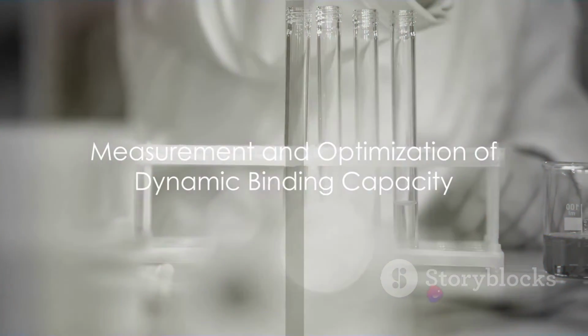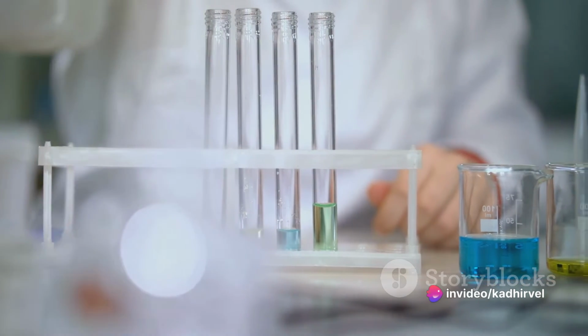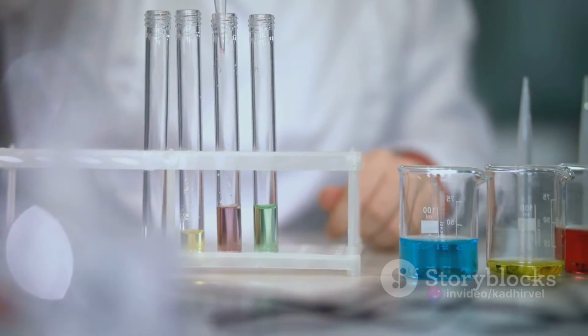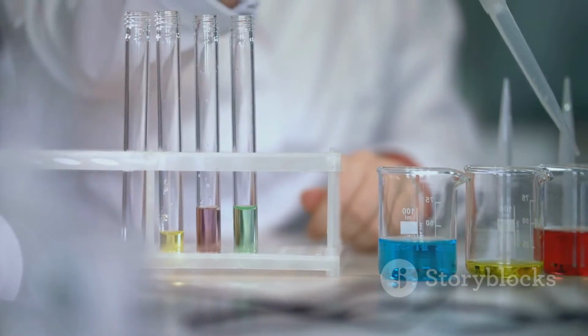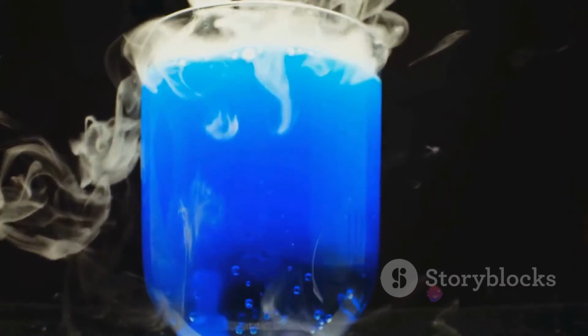DBC is typically measured through breakthrough experiments. In these experiments, the solute is loaded onto the column until breakthrough, or when the solute starts eluting from the column, is observed. The amount of solute loaded at breakthrough corresponds to the DBC.